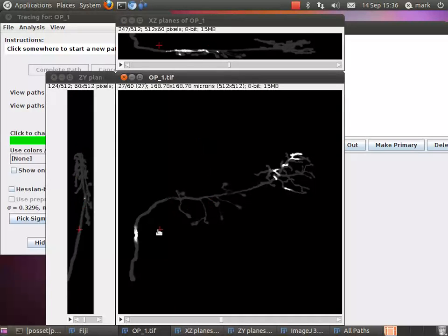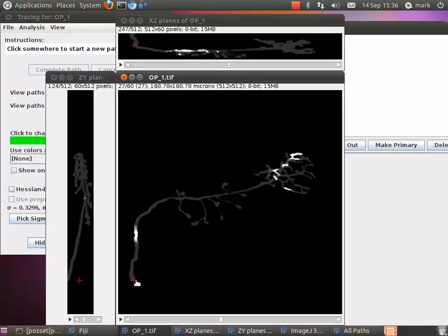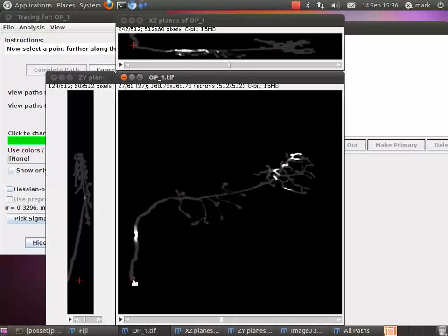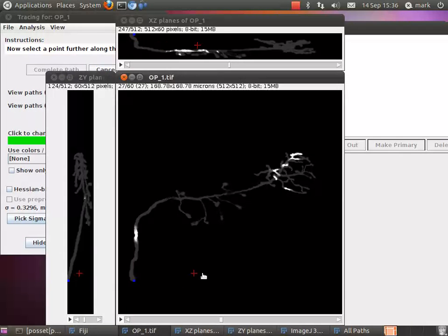So when this really becomes useful in its own right is the new keyboard shortcut M. Essentially, if you move the mouse over a particular point and instead of clicking the mouse, let's say at the end of this process here, you just press M. That's as if you clicked at the point of maximum intensity or the median of all the points of maximum intensity through that particular point.